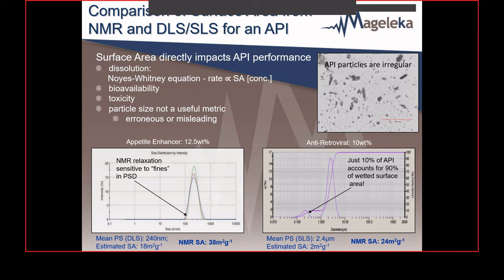However, again, as I said, this is bimodal. If you now look at this little peak down here, where this one is, and you take this size here, the D10, if you look at the cumulative distribution at about 10% here, you see at that point there, you now take the D10 and take that value and calculate it.